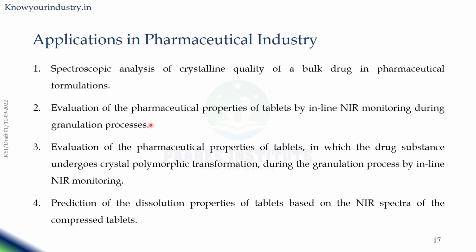It is also used to evaluate the pharmaceutical properties of tablets by inline NIR monitoring during the granulation process. So this is a continuous, online process. When the granulation process happens, IR spectroscopy is done immediately to confirm the pharmaceutical properties of the tablets.